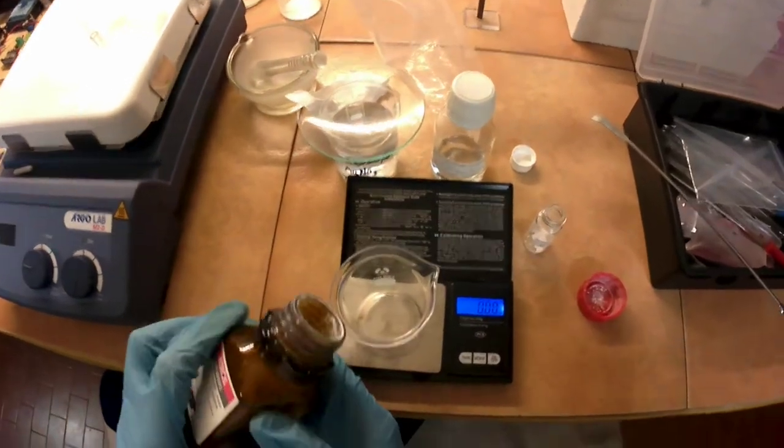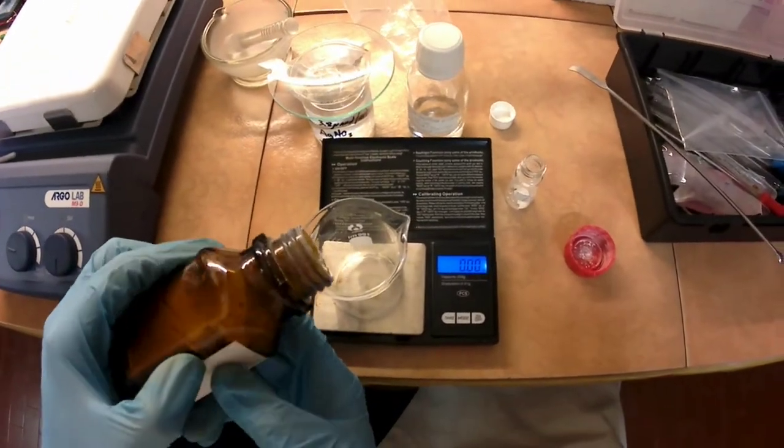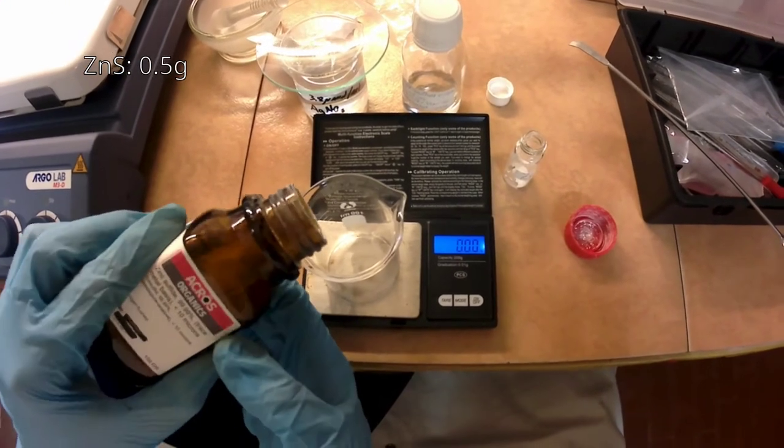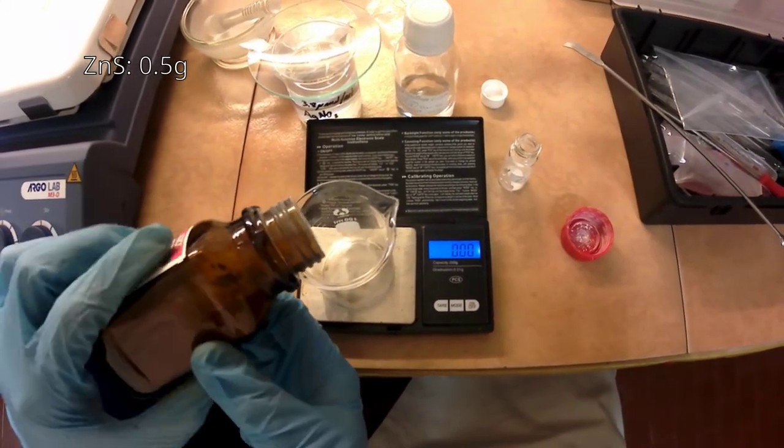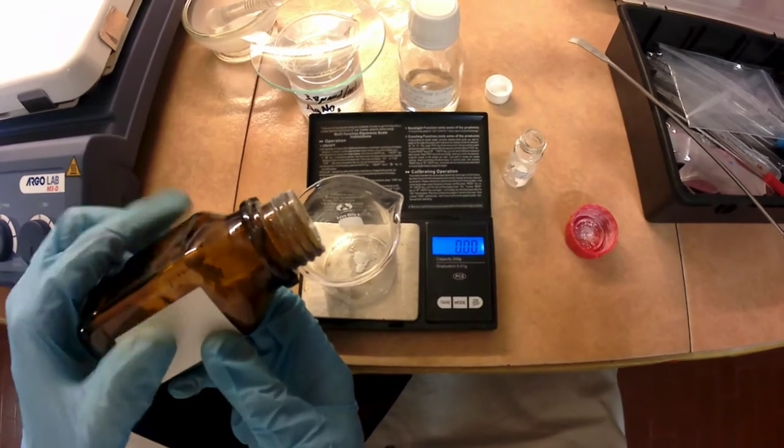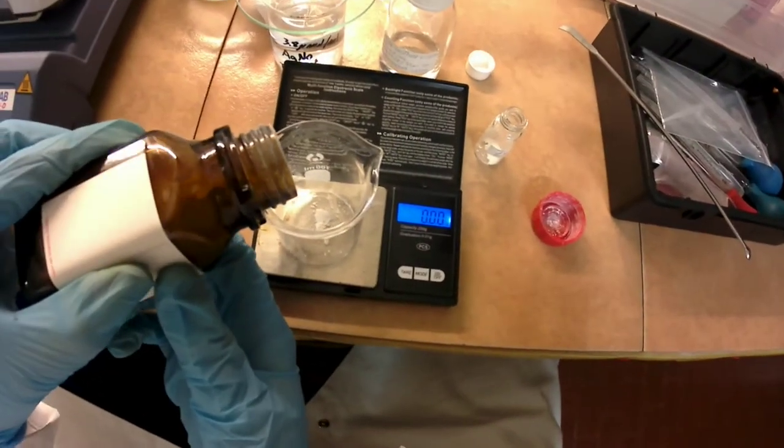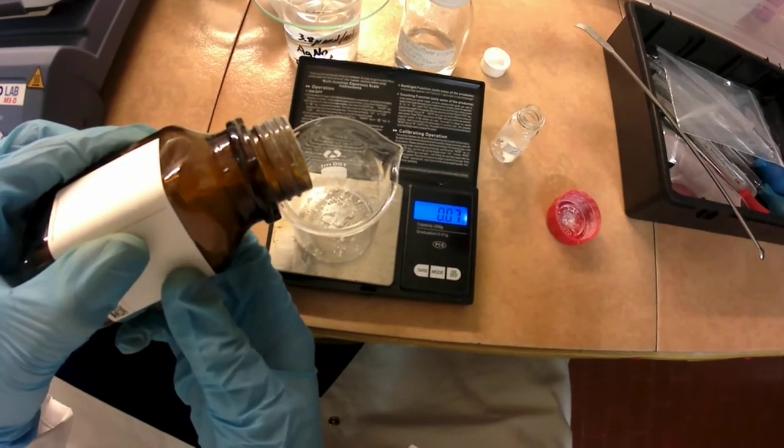The procedure is also remarkably similar to the green phosphor synthesis. The first step is to weigh out 0.5 grams of pure zinc sulfide in a clean beaker. In my case, I am using 99.99% zinc sulfide that I bought from a chemical supplier.